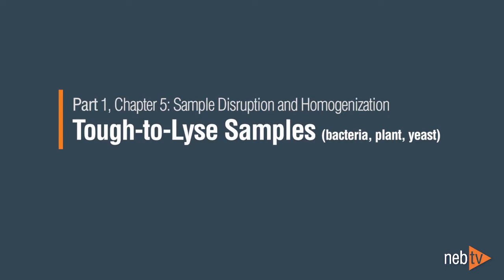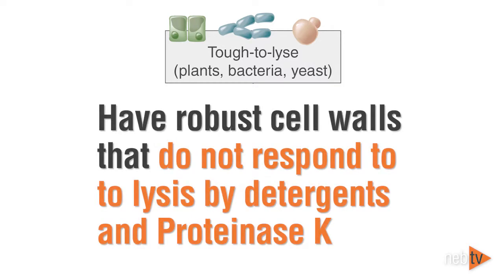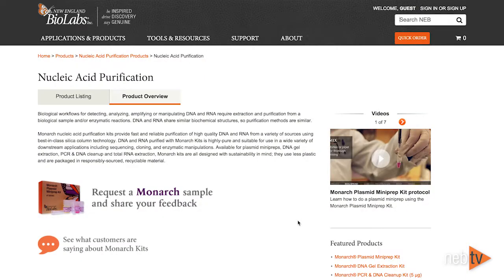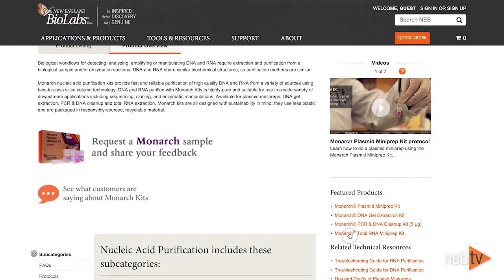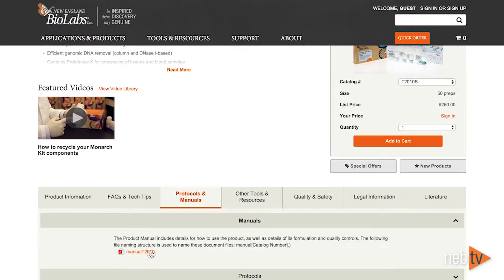Part 1: Sample Disruption and Homogenization for tough-to-lyse samples, including bacteria, yeast, and plant. Tough-to-lyse samples have robust cell walls that do not respond to lysis by detergents and Proteinase K. The use of glycanase enzymes, which are not provided with this kit, can facilitate the lysis of cell walls. Details on reaction conditions can be found in the product manual. Alternatively, mechanical lysis methods such as using a bead homogenizer allow efficient disruption of these samples.